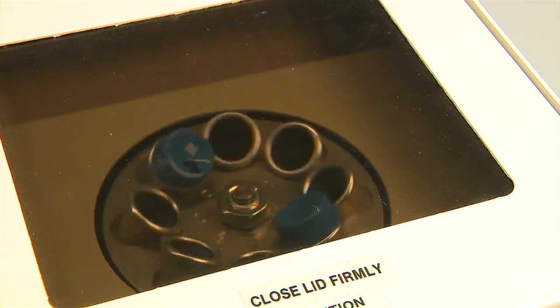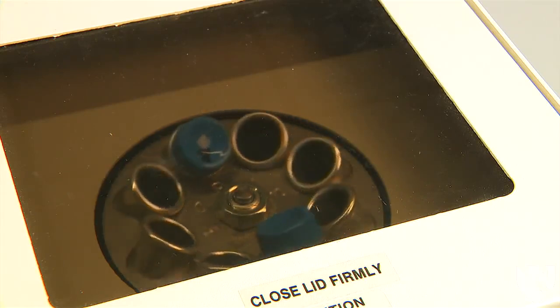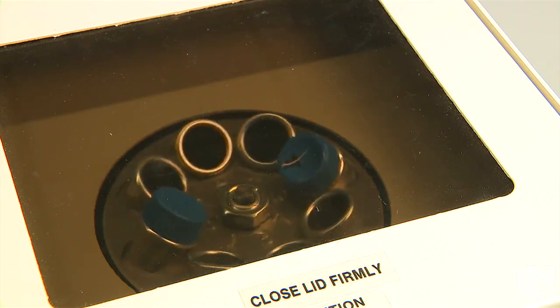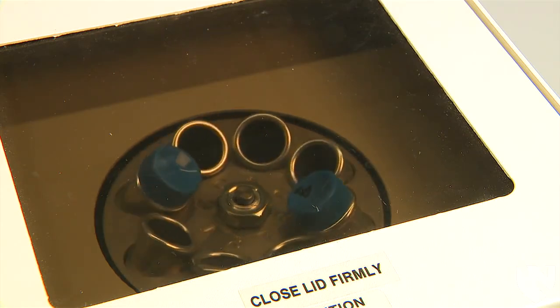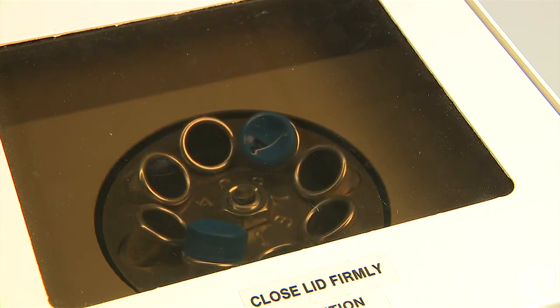Once the 5 minutes have passed, let the centrifuge come to a complete stop on its own. Do not use the brake. Using the brake could disrupt the urine sediment. If the brake is used, the urine specimen needs to be centrifuged again.